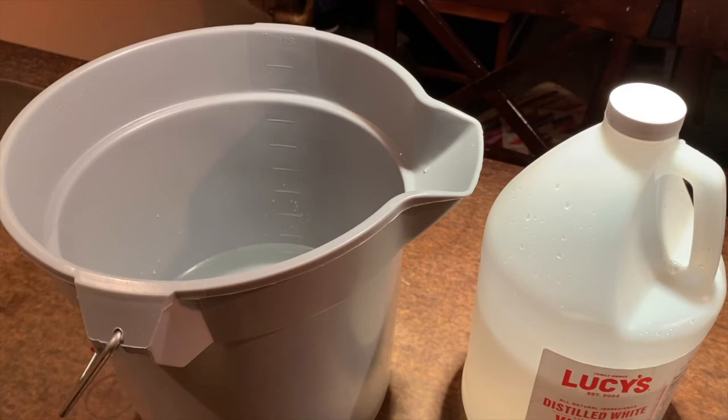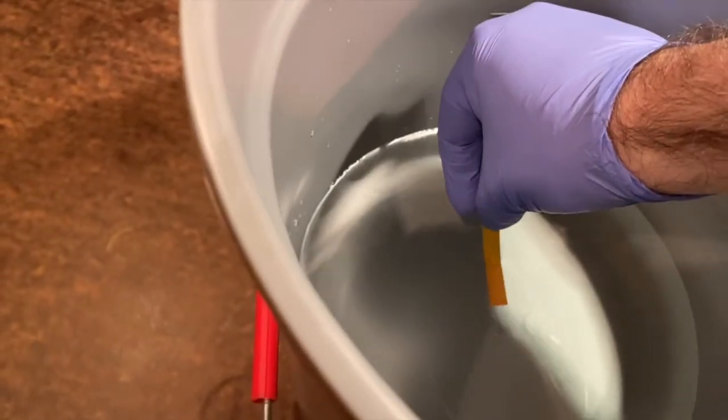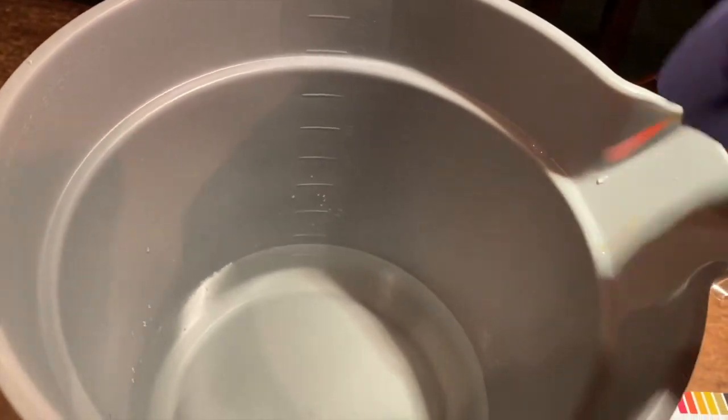Thus I can use it to quickly neutralize any hydroxide that gets loose on my hands or on any work surfaces. It also provides a place to dump my alkaline solution when done with the experiment. I even have some pH paper ready to verify that the solution remains acidic after adding hydroxide to it.